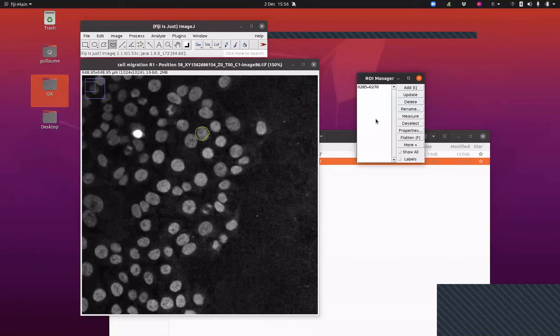And then I will only annotate, let's say, 10 or 15 images, depending on how many structures you have in your image. Then I will use ZeroCost to train my first StarDist model with a very small data set. I will use augmentation to increase it, and then I generate my first model. It's not going to be a great model, for sure, because your data set is small.